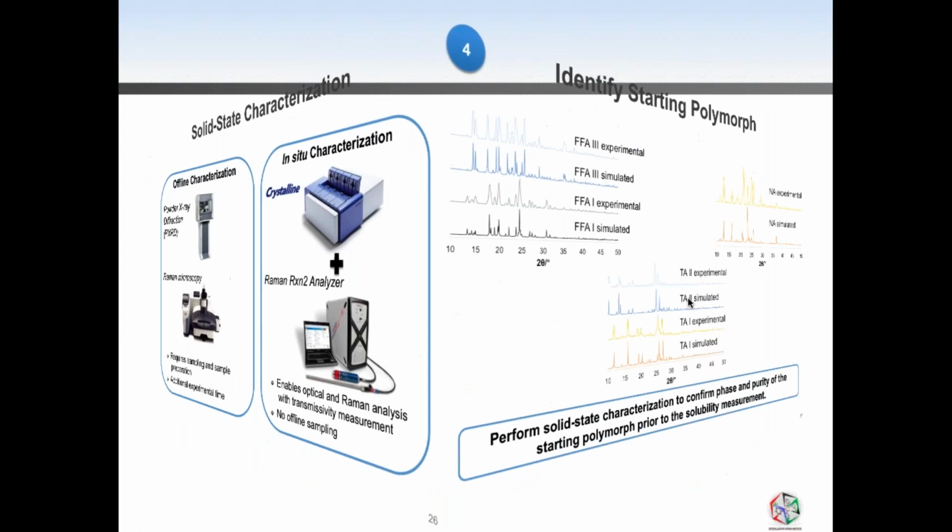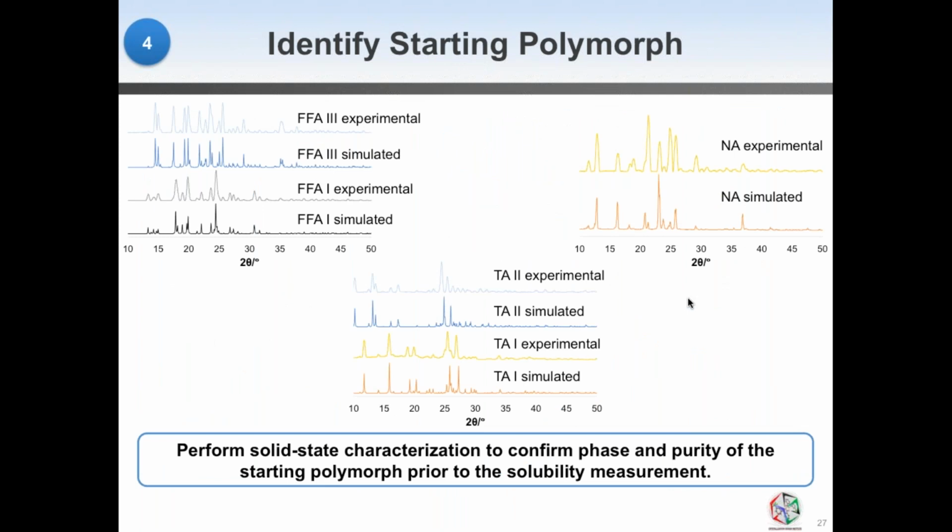Before the solubility measurements, the solid state needs to be characterized to clearly identify the polymorph and purity of the starting material. Here, we're showing the experimental PXRD data, as well as the simulated diffractogram from the crystallographic information files for each of the systems employed.